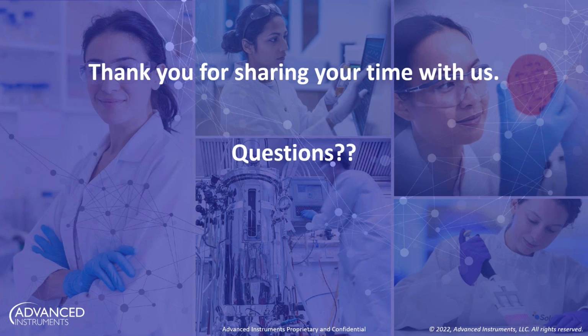Great question. I think a lot of labs are in that space, so don't feel bad. The fact that you've identified that you want to move is already a great start. As a vendor of a device like an osmometer, what we would recommend is start working with us early on in helping you transition.